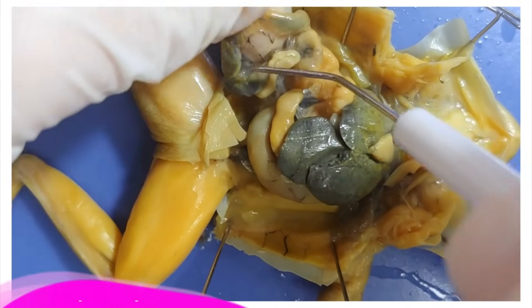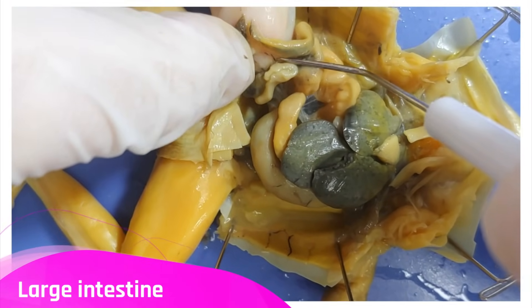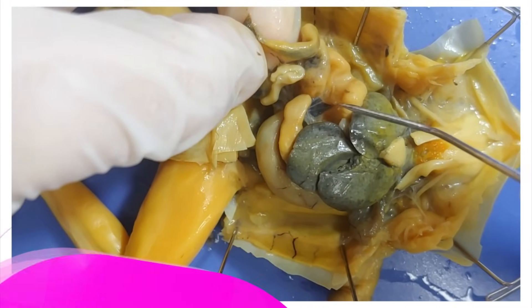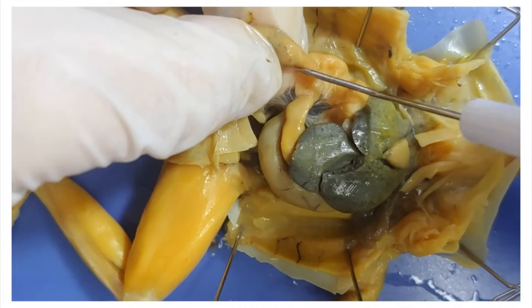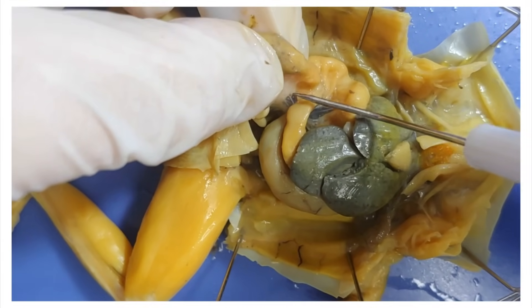Down here is the large intestine, where excess water from the food is absorbed and feces is made and stored. It's connected to the small intestine, which is the previous stop on the digestive system before the large intestine.